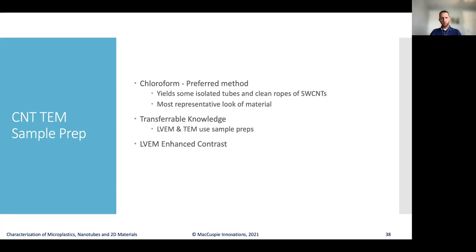And to me, the most important aspect of this is its transferable knowledge between both low voltage electron microscopy and transmission electron microscopy, as they both use the same sample prep techniques. And the LVEM can provide, again, the enhanced contrast of these materials.